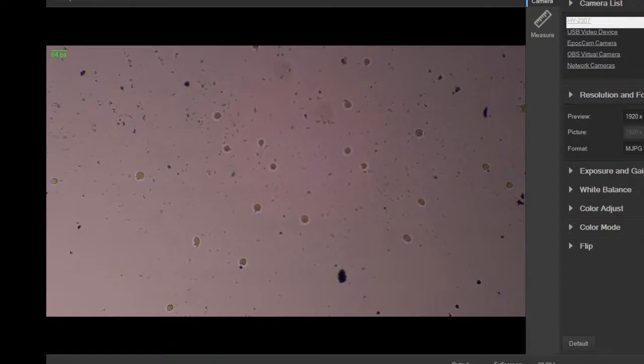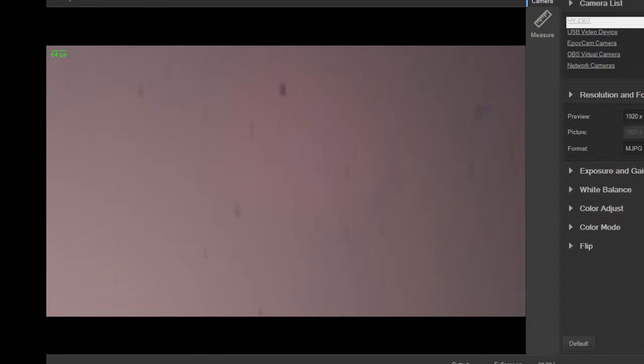But it uses a special oil immersion lens that you have to put a special drop of oil on, because the refractive index of air causes too much distortion in the eyepiece. So you end up having to do the oil. The oil they use is a special kind of oil that bends the light correctly. So you get nice magnified views without chromatic aberration and other kinds of focus issues. It's pretty neat stuff.